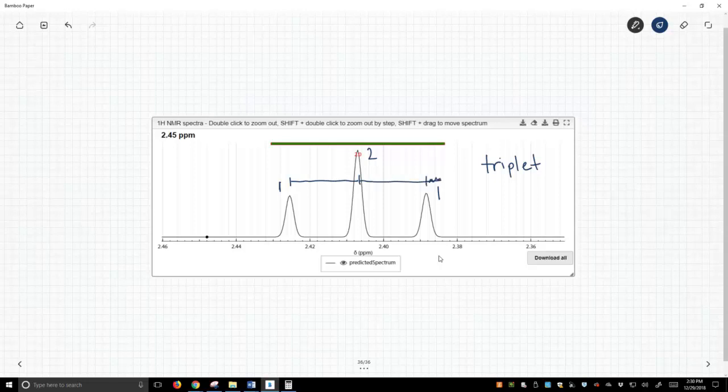So we need to figure out the exact position of this peak, and I looked at this very closely by eye, and my best guess is that this peak, this leftmost peak of our triplet, is at 2.4255.